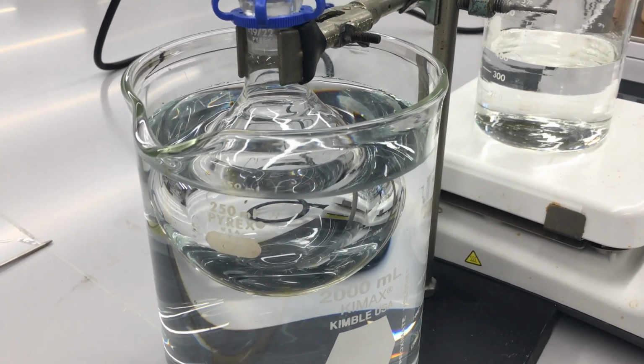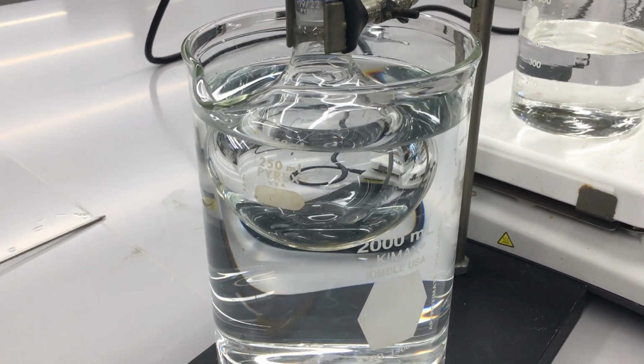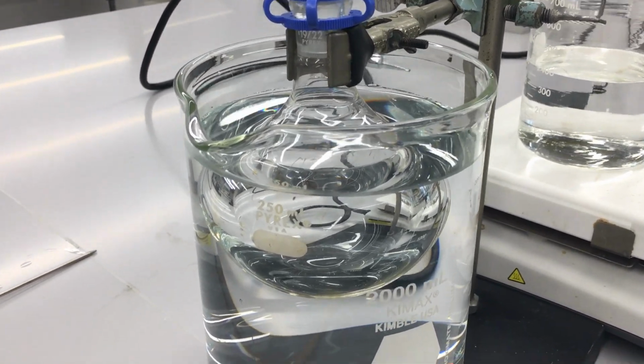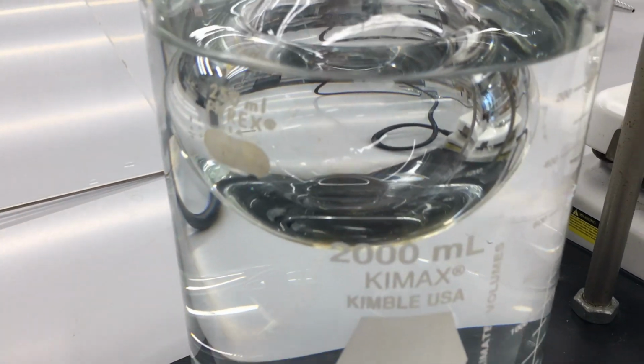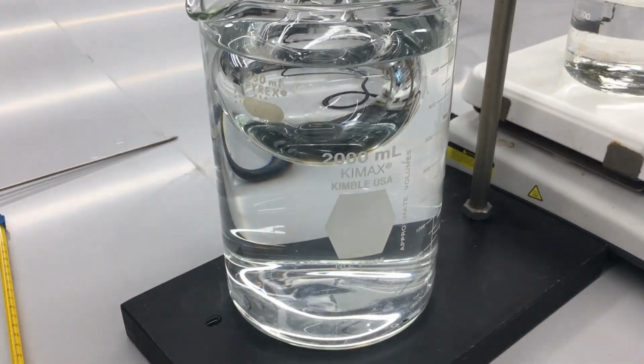All right, and so over some time, we should start to see a pool of liquid forming at the bottom, right there. And that shows us that we're condensing our gas in this container into a liquid.